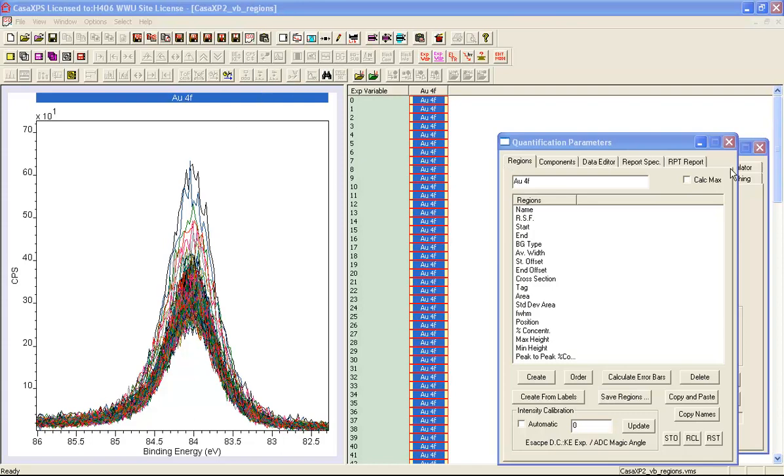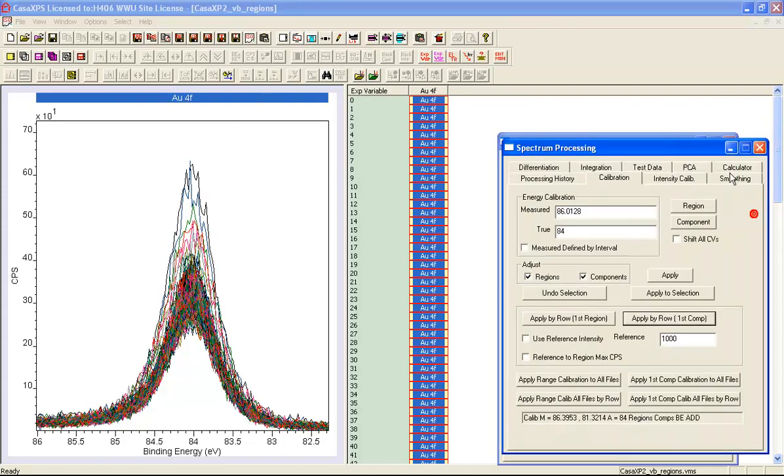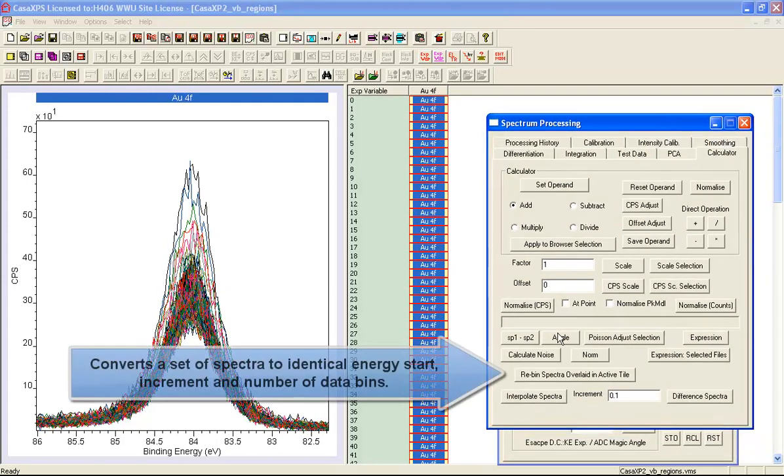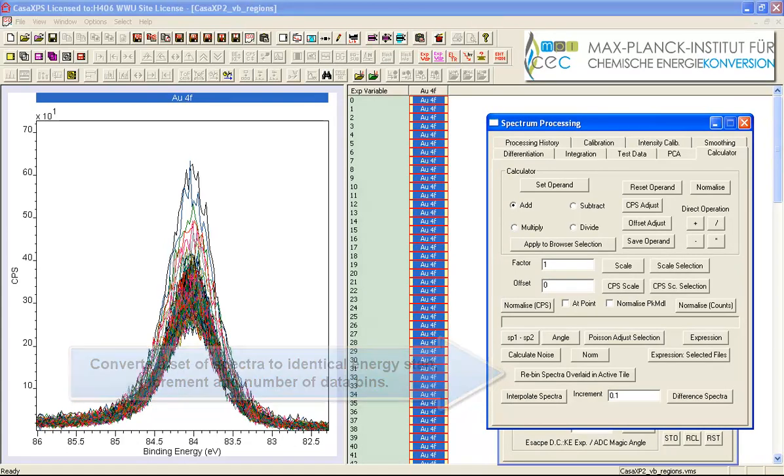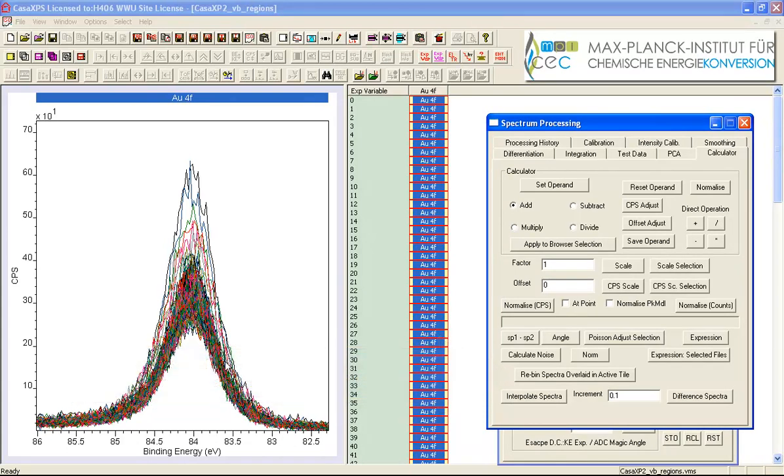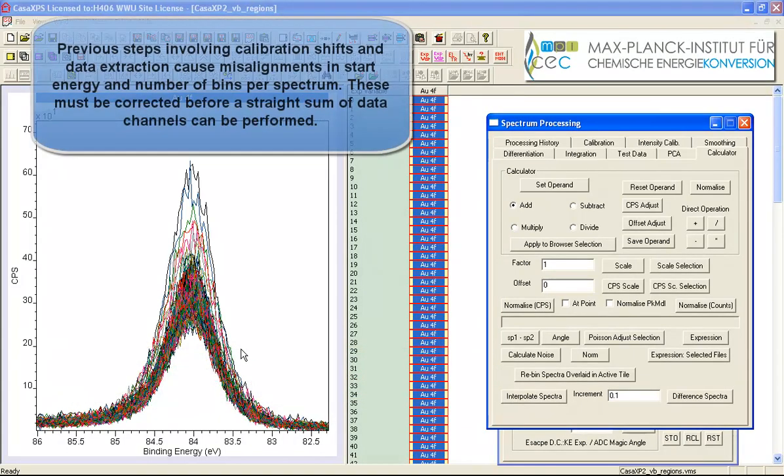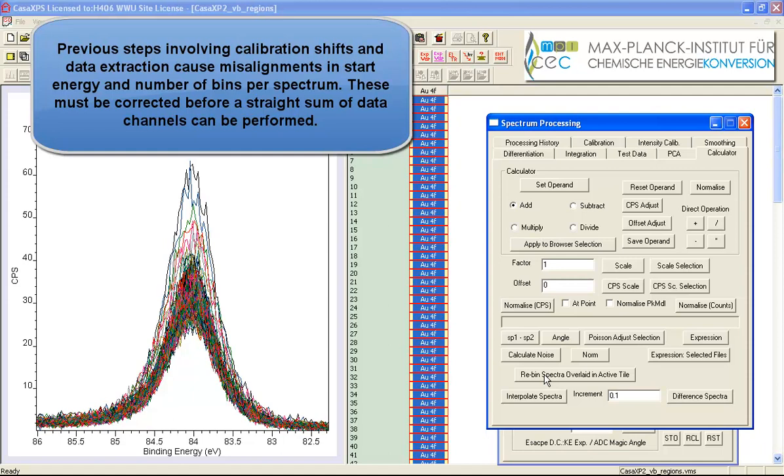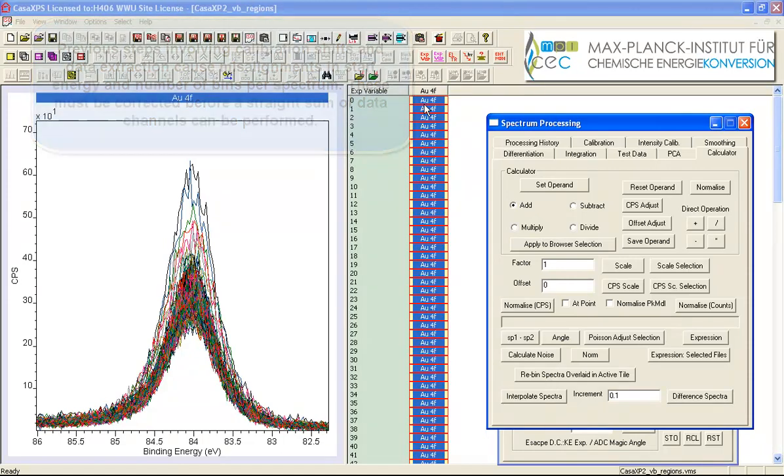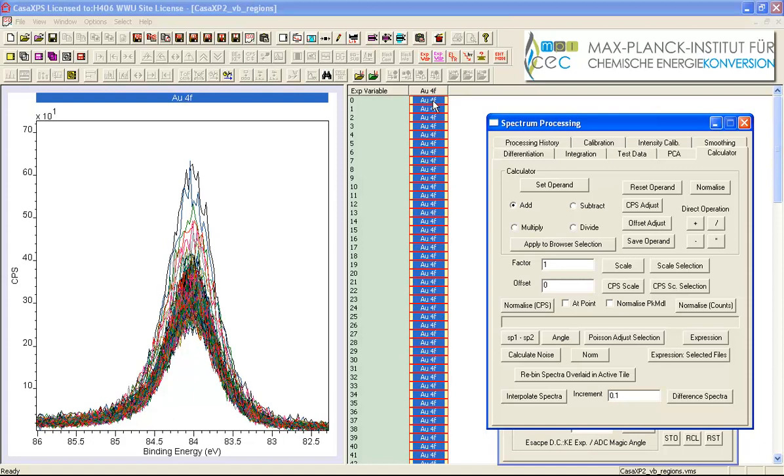Now one more thing that I need to do is I'm going to use a new option here that will let me re-bin these data. We've done some processing to get to this point where we've pulled out a region, we've calibrated the data more than once so the likelihood of the start and end offset and the increments for all of these spectra being the same is unlikely. So if I re-bin them what I will effectively be doing is I'm taking the energy scale from the first spectrum in this list and I'm going to interpolate all of these data onto that same energy scale.